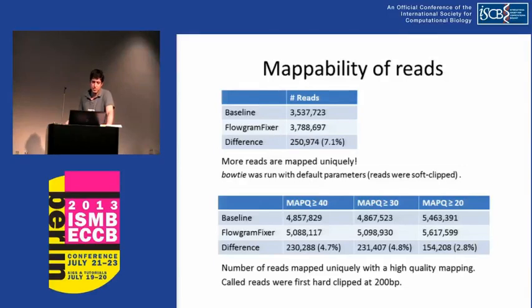Okay, so this was really good. We were very happy with these results. And by the way, I mentioned earlier the double exponential. Initially we had only 5% here, and switching to the double exponential, which is a heavy-tailed distribution, upped us to 7%.